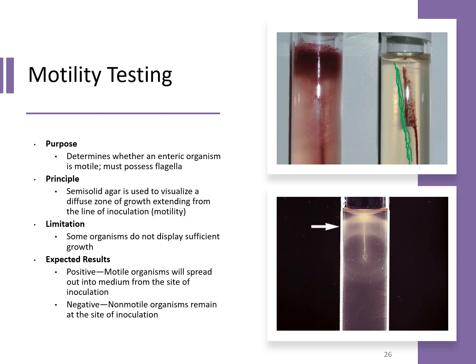And then what we're looking for is if it has motility, then that organism is able to diffuse throughout that agar. So you can see here at the top where you have growth within that agar outside of that slant. You can see the growth coming out here. So the whole agar kind of appears as a cloudiness, whereas this one is clear around those edges outside of that stab.